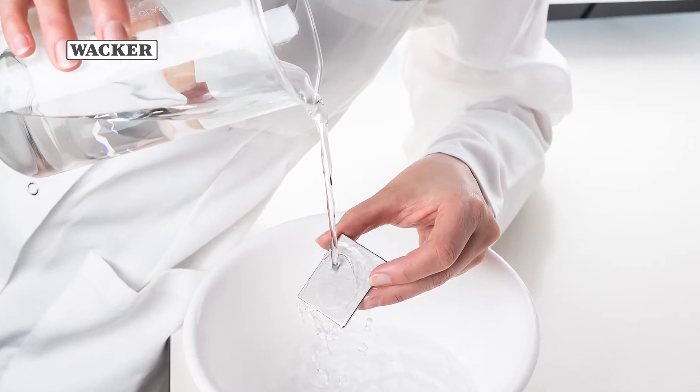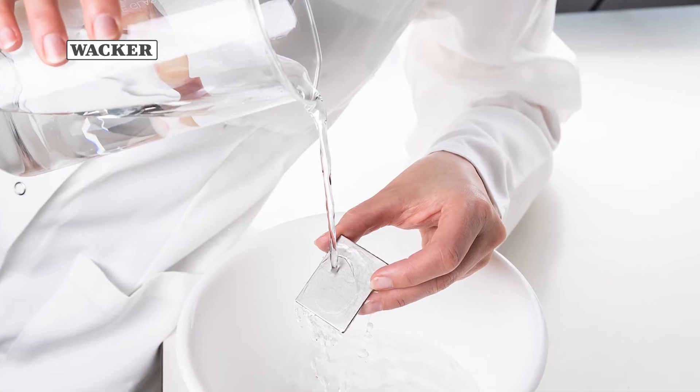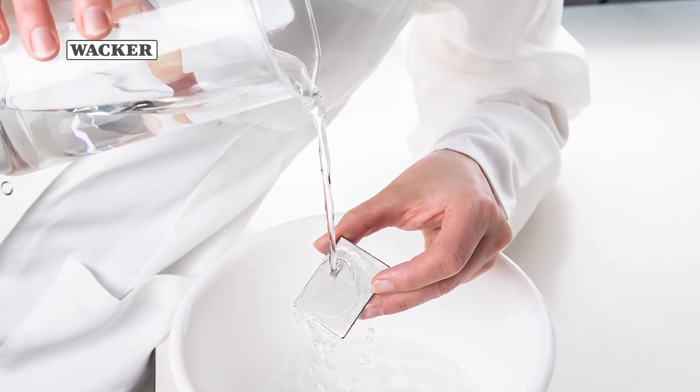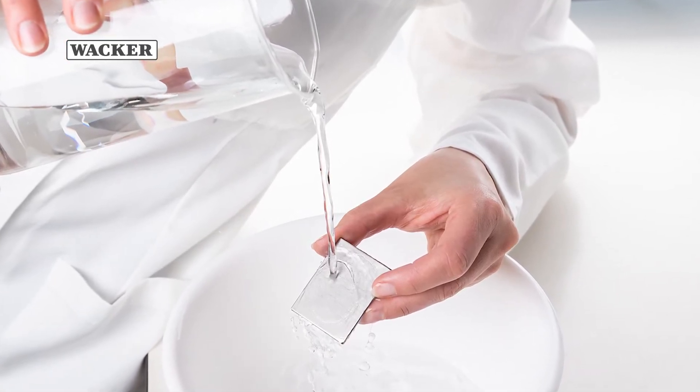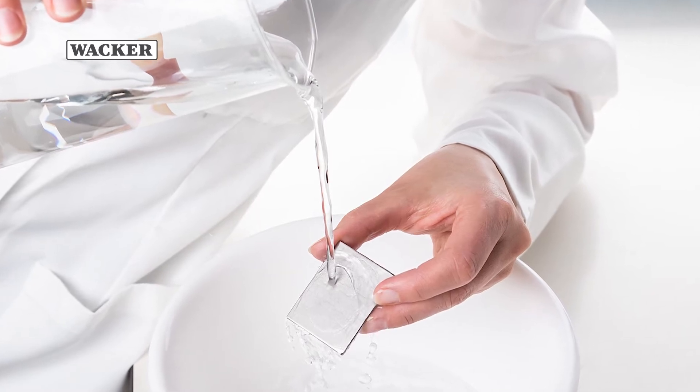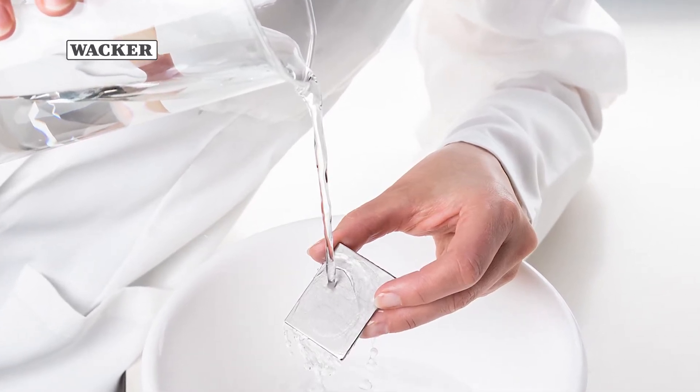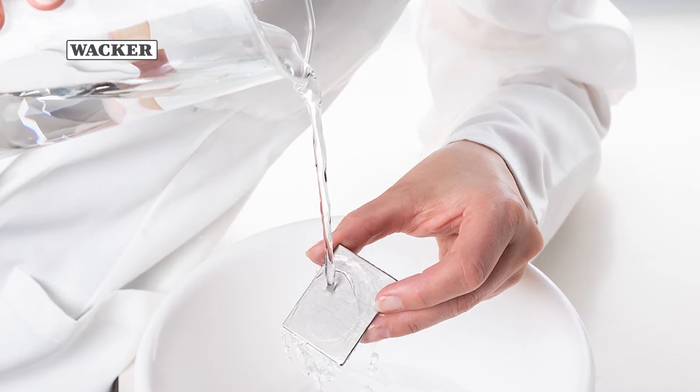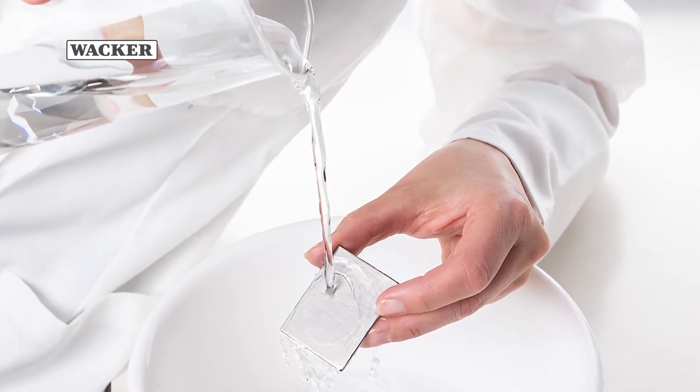The cleaning test is performed in the laboratory in order to gauge how well our LeoSeal TS lotions can be cleaned. This is done by replicating a situation in which a lotion has dried onto a stainless steel container and determining how much can be removed with water and other cleaning agents.